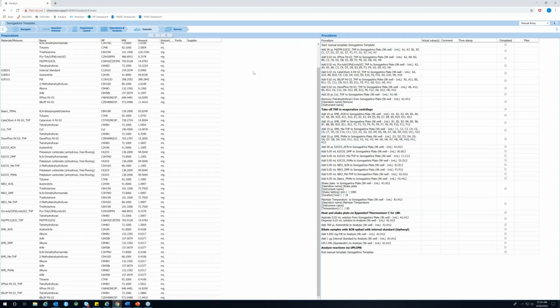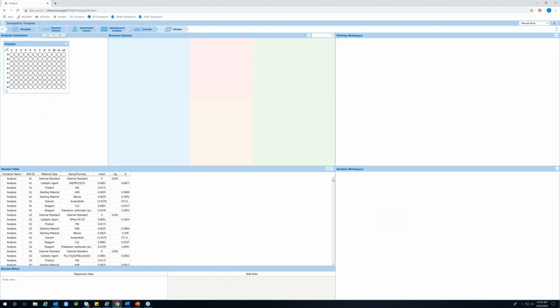So it really is paramount to getting our end users, who again are not necessarily skilled or adept at high-throughput experimentation, using this capability. And then lastly, we have that review chevron, where we have a defined analysis plate that's just waiting to receive data from any of our analytical techniques to, again, get them to that informed decision very quickly. So I think now Andrew will demonstrate more of this analysis tab and how they utilize their software to build that.